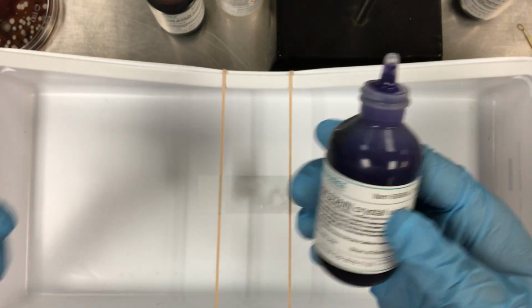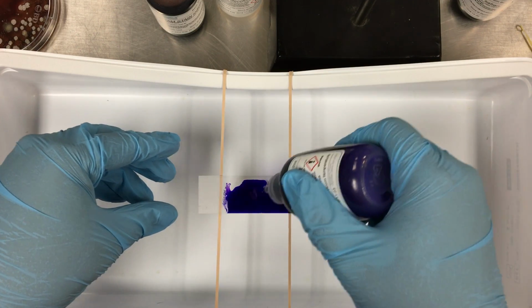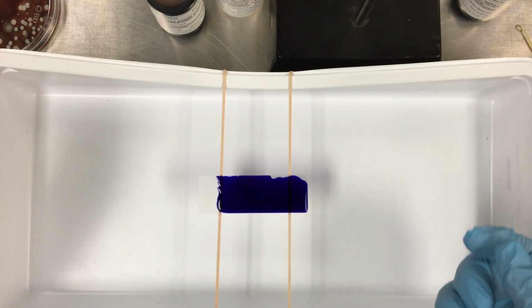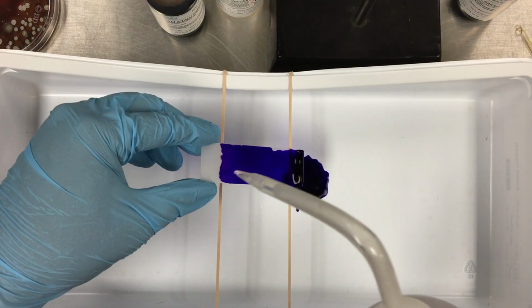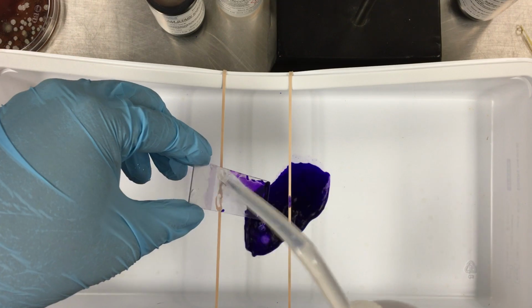So step 1 is crystal violet stain. You want to just drip this on and cover all parts of the slide that have your sample on it. And watch the clock, because we're going to let this sit for 60 seconds. After 60 seconds, take some distilled water and rinse it away.